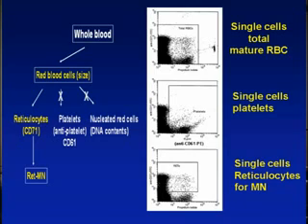And this would be the cells that have the expression of the platelet. So they are the platelet cells. Okay? So we don't want them. So we first say we want these cells, not those. So this is region. And secondly, say we want everything else but not this group of cells. And finally, we look at this particular display.